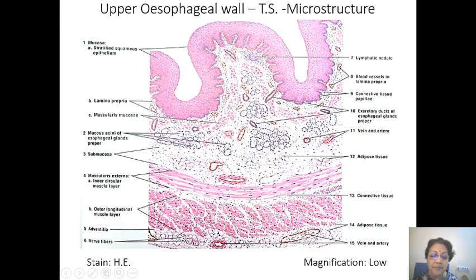part of the gut. Alright, so in submucosa we are seeing mucous acini and we are seeing a lot of loosely arranged irregular connective tissue. This looks like a bunch of adipocytes, a little bit of fatty tissue, right? Single adipocytes with single flattened nuclei. Then probably a venule, and this is probably an arteriole because it has a little bit more muscle in it. And adipose tissue labeled over here.